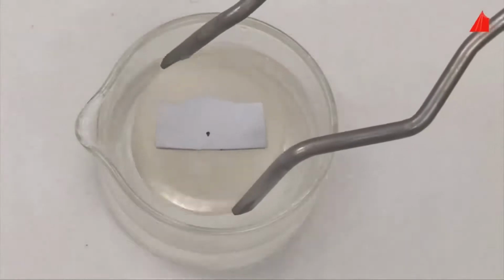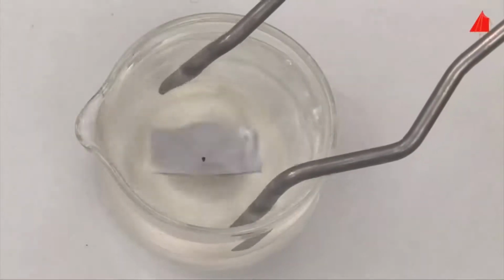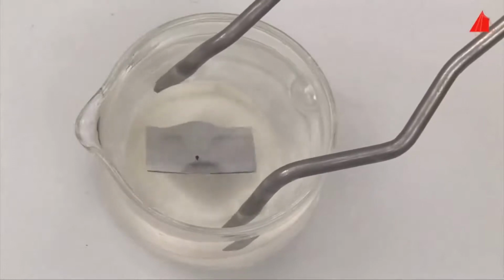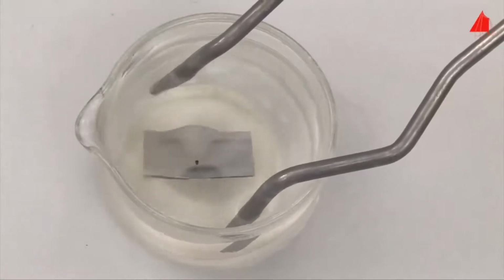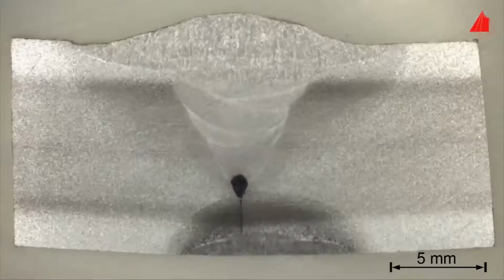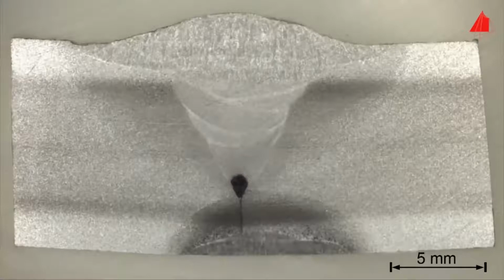Weld joints can also be examined metallographically. In our case, the etching process takes a little more time and the analysis is more difficult. But by and by, the structure inside the steel plates, the position of the weld passes, and the heat-affected zones may be identified with a skilled eye.